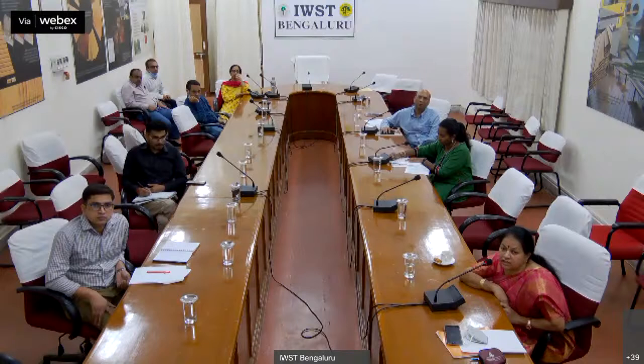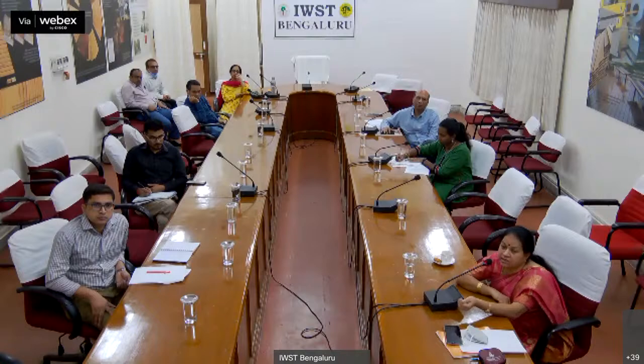Sir, actually the rates are fixed by ICFRE. Whatever rate is given, we are charging. Mostly for red sanders we receive samples from police cases, from all over India. When a sample is given to us, we have to identify it, and we have to boil it for many days and study it under the microscope. Then after giving the report, they call us as witness. When we go as witness, our traveling expenses will be more. That's why we are charging 20,000, sir. It is uniform for all.